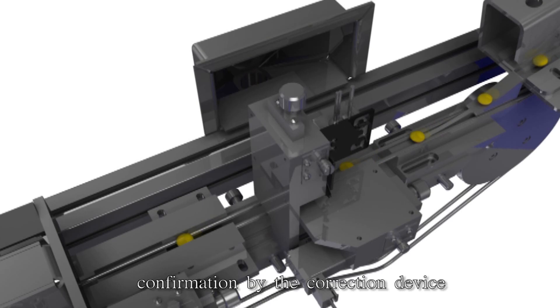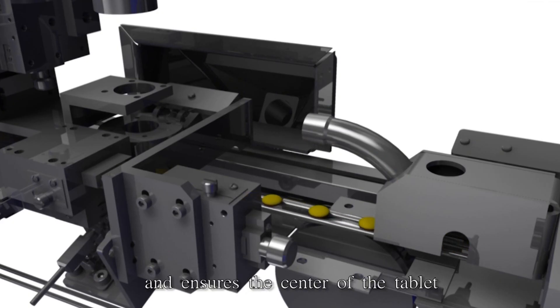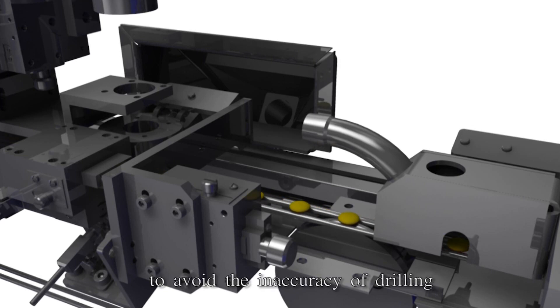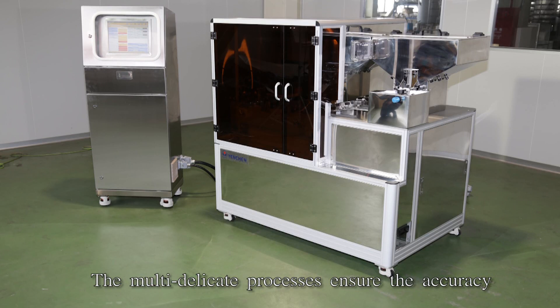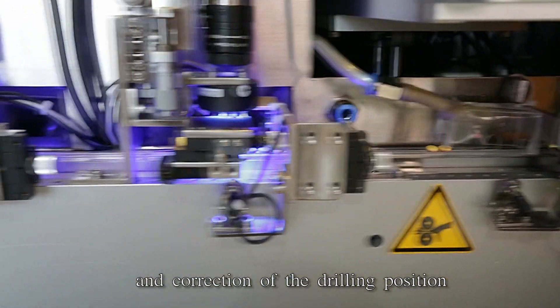Before the drilling process, confirmation by the correction device takes place again and ensures the center of the tablet is at the center of the conveyor to avoid inaccuracy of drilling. The multi-delicate processes ensure the accuracy and correction of the drilling position.